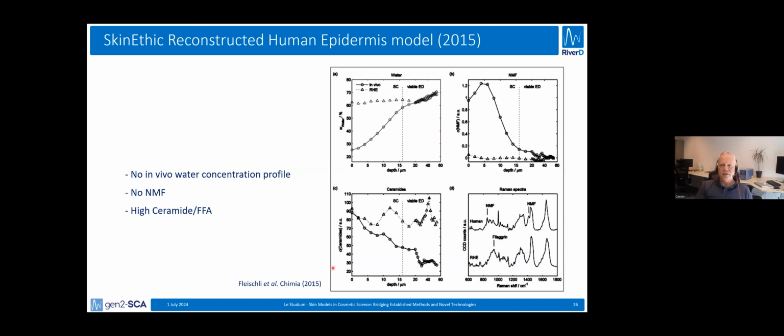Here is another on a SkinEthic reconstructed human epidermis model from a group in Switzerland, similar to what we found for the previous skin model. They saw no.